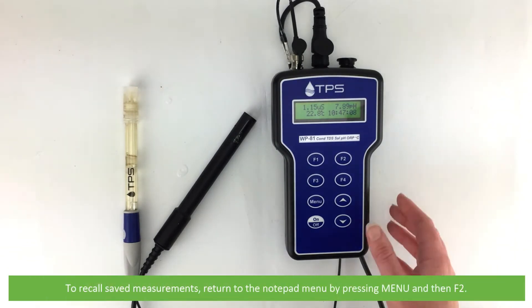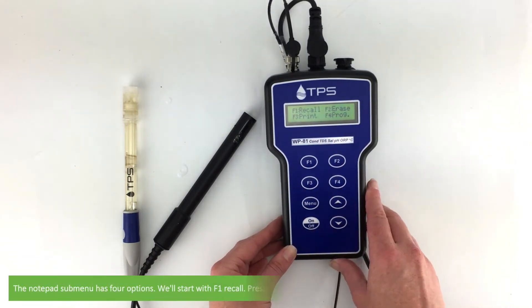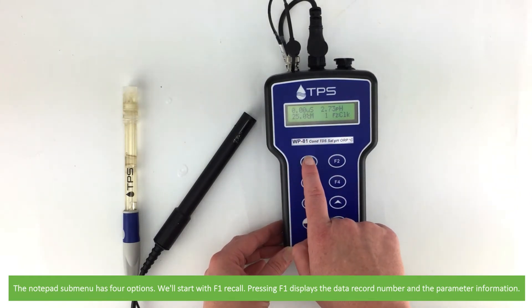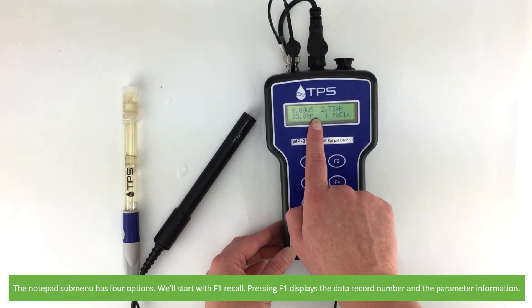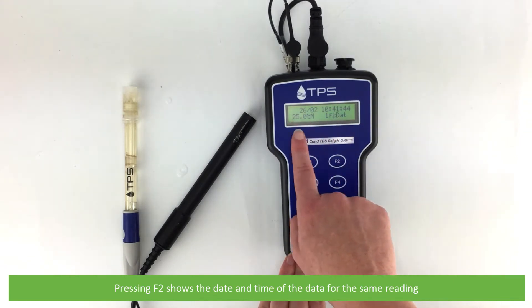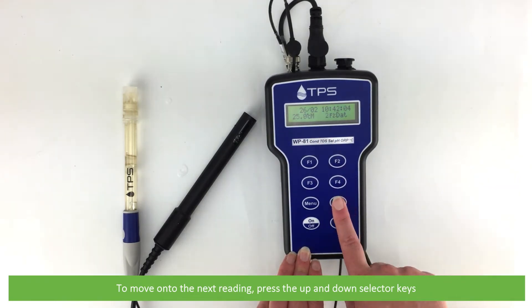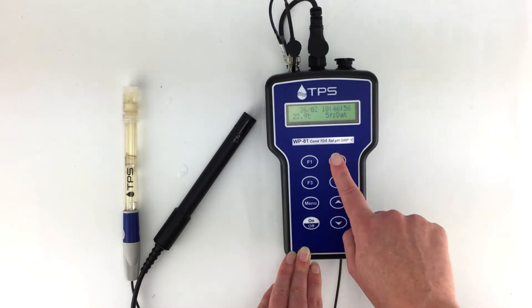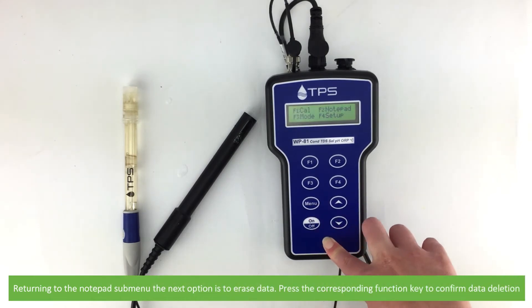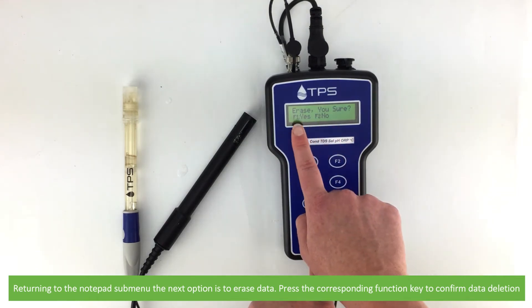To recall saved measurements, return to the notepad menu by pressing menu, then F2. The notepad submenu has four options. Starting with F1 recall — pressing F1 displays the data record number and the parameter information. Pressing F2 shows the date and time of the data for the same reading. To move on to the next reading, press the up and down selector keys. Returning to the notepad submenu, the next option is to erase data. Press the corresponding function key to confirm data deletion.